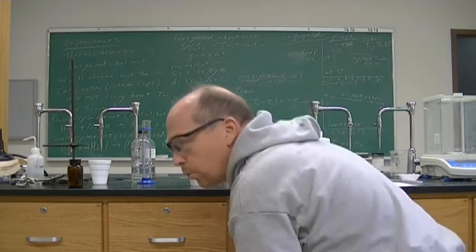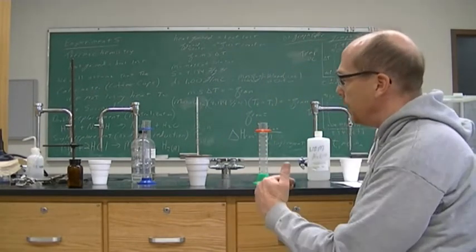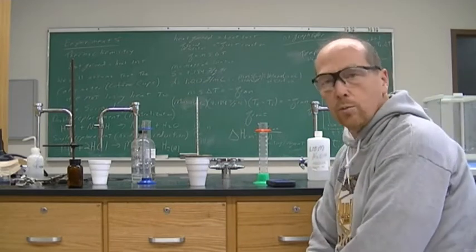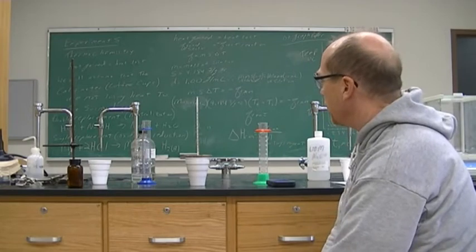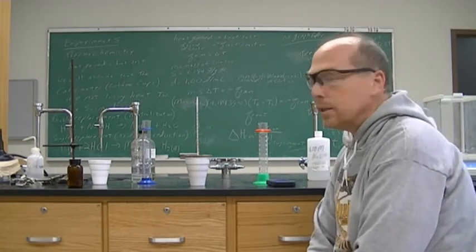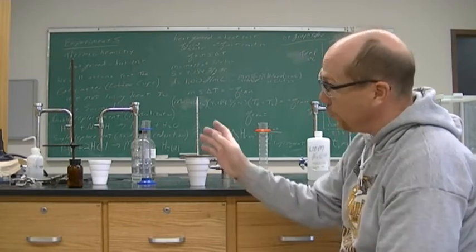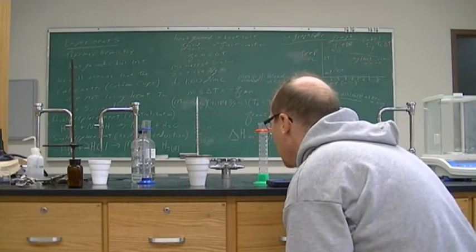This is going to be a pretty boring graph. It's just going to go straight across at the 19, and it's going to go straight across at the 24, which makes this a very, very simple graph to make. I will talk about how the graph sometimes looks and will most likely look for our next one. But this one looks to be very simple.